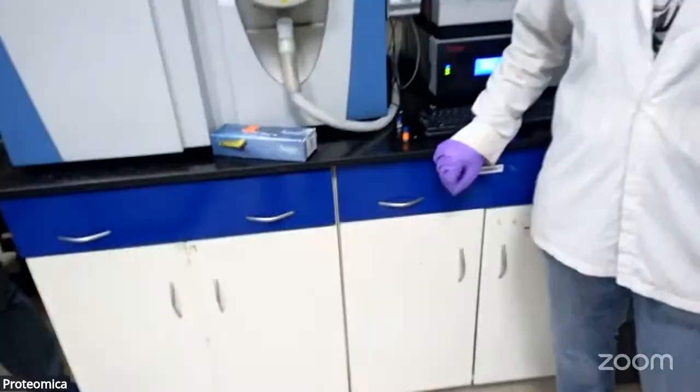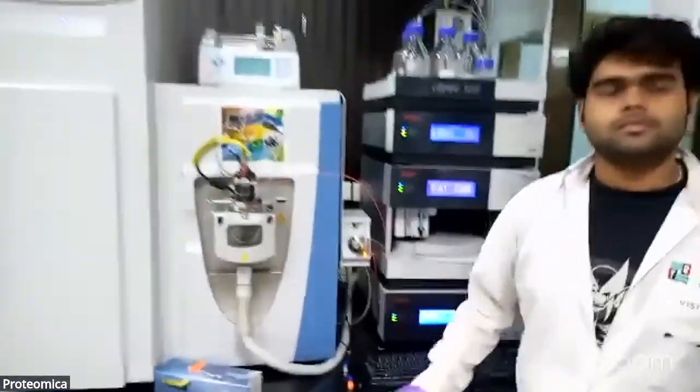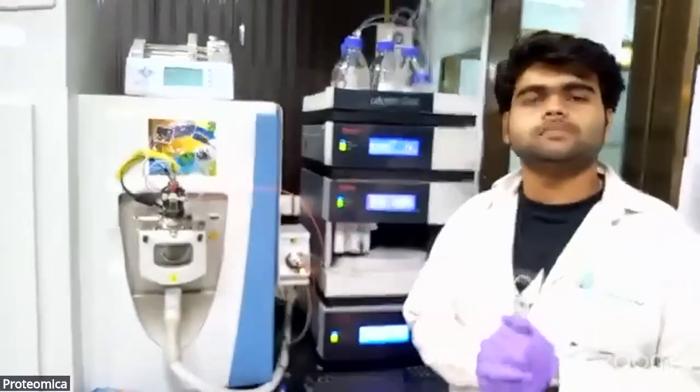With the same samples you have done the proteomics experiment. There is another mode called metabolomics and lipidomics. Just to give you a brief, these two profiling methods can also help identify markers which can play a critical role in clinical applications and disease detection. So I will point you to the instrument. This is the instrument in which we perform metabolomics and lipidomics.